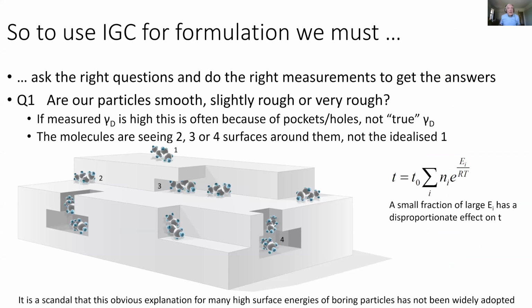So to get these insights, we must, first of all, ask the right questions and do the right measurements to get the answers. If you are only interested in surface energy, that's a sad fate, but if you are, then okay, make sure you measure surface energy. But make sure you are asking the right question, not just saying, well, surface energy is the answer to all known problems, because it isn't.